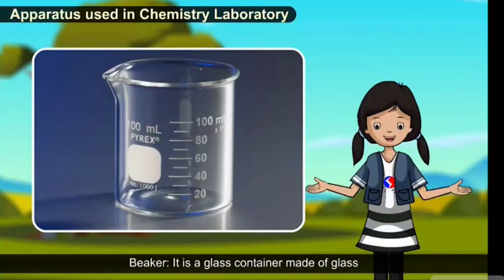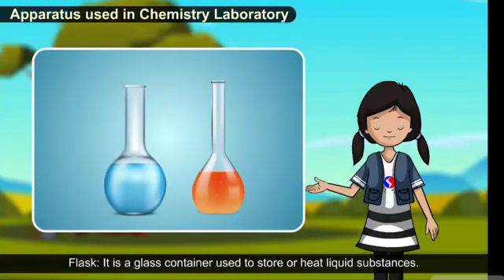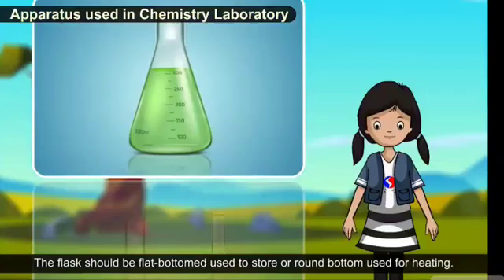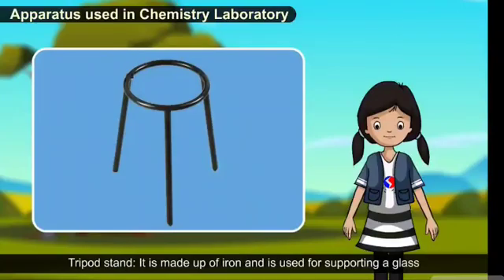Beaker. It is a glass container made of glass and is used for holding or measuring small quantities of liquids. Flask. It is a glass container used to store or heat liquid substances. The flask should be flat-bottomed, used to store, or round-bottomed, used for heating. Conical flask. It is used for mixing of different solutions.